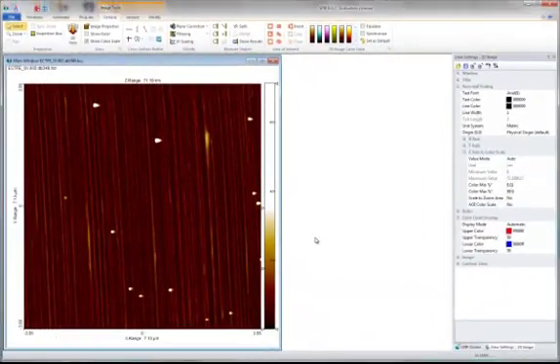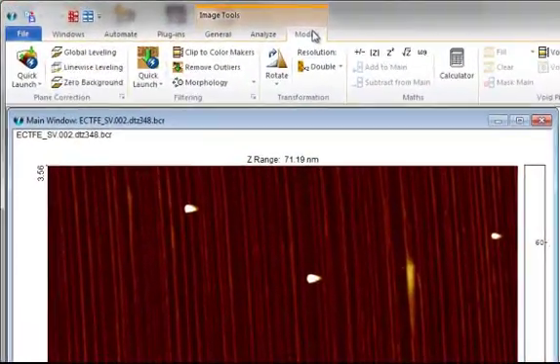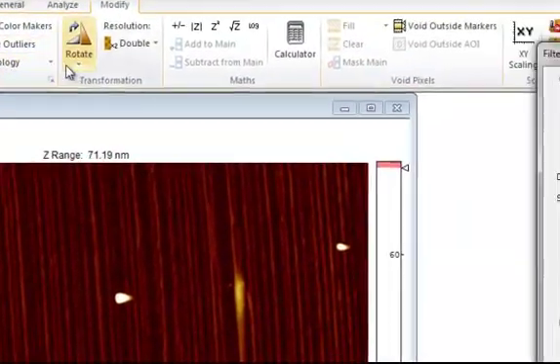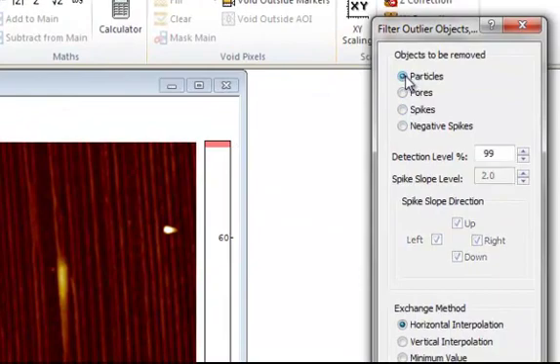In this image, we want to remove the outlier particles on the surface. For that purpose, we will use the Remove Outliers dialog. We'll select Particles to have particles removed. Then we'll set a threshold.